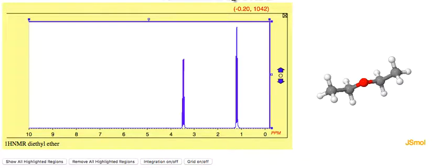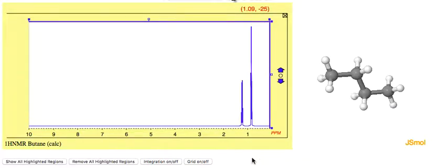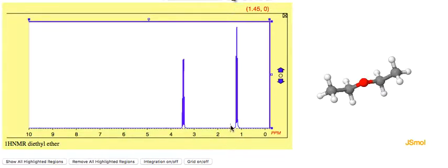And really the only thing different of this spectrum from the other spectrum is that this quartet got shifted over. So let me go to right there, I believe. So this one, you had the triplet and the quartet, and for this one, you've got the triplet and the quartet, but this is shifted a lot, and that's because this oxygen is right nearby. So the oxygen on that carbon is going to de-shield the peak due to these hydrogens substantially. It's very similar to that 3.8 on the one from the other video. Okay. And the integration again is 2 to 3.